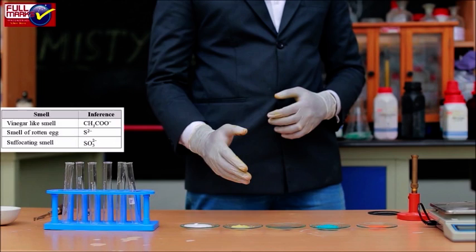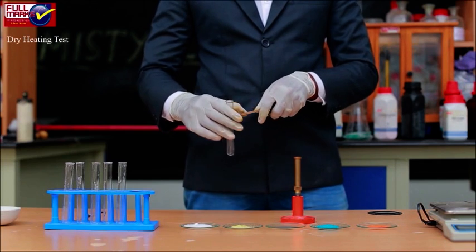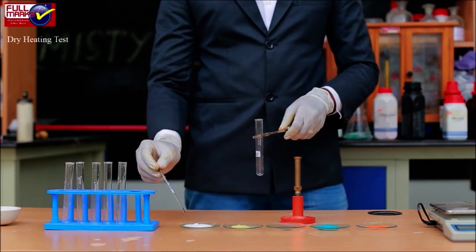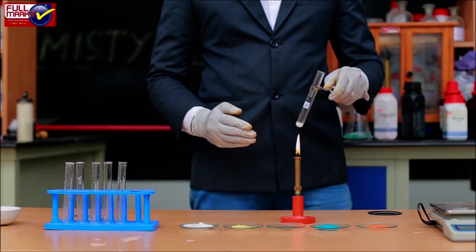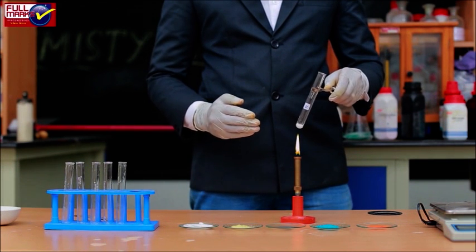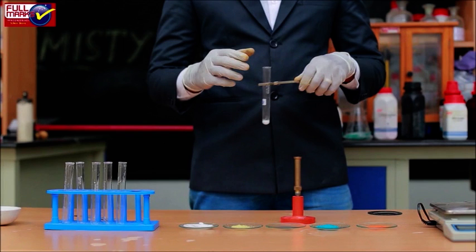Dry heating test: A small amount of salt is taken in a dry test tube. The test tube is heated gently and then strongly. Important information can be obtained by conducting the dry heating test. Colorless or odorless gas indicates CO₃²⁻ (carbonate). Colorless gas with smell of rotten eggs indicates S²⁻ (sulfide).